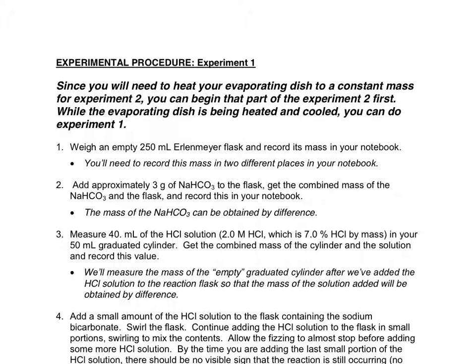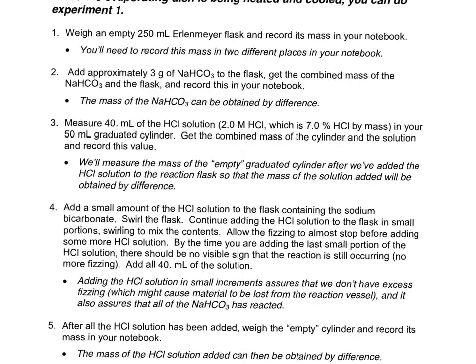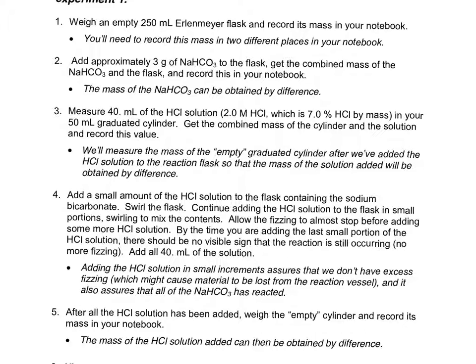All right? So step number 4 says how methodical you are going to be adding the HCl to your little Erlenmeyer flask. It says add a small amount from your grad cylinder. Okay, let it fizz.